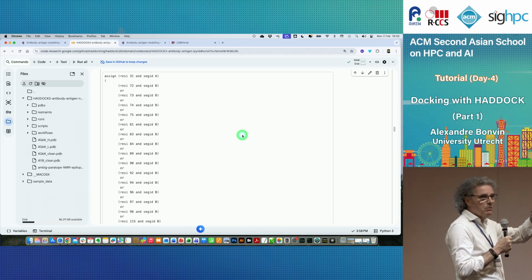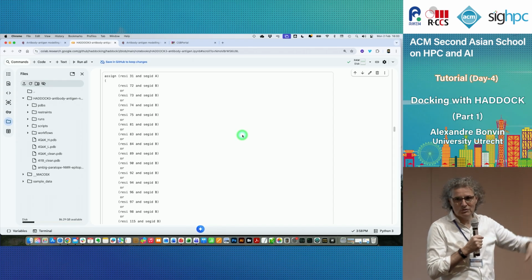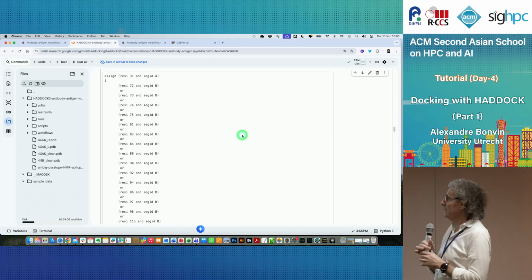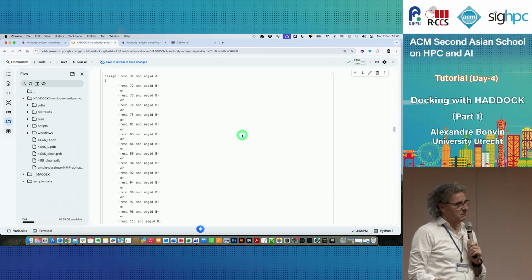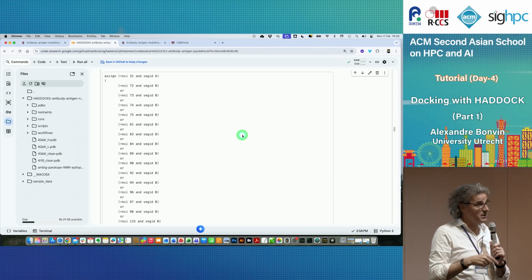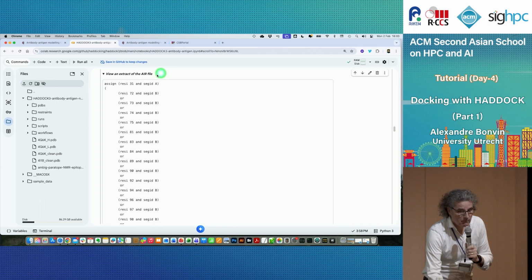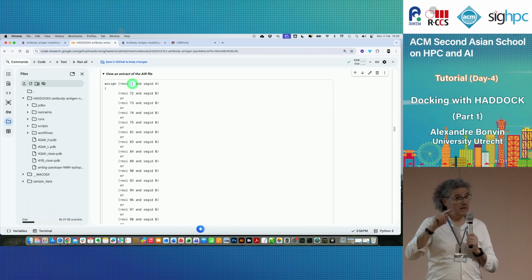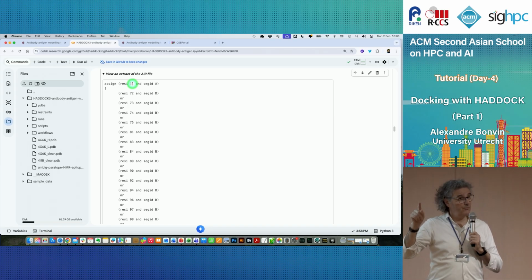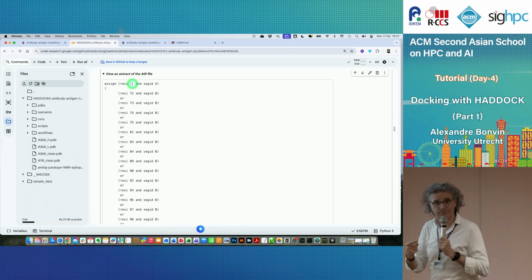We have 4 on the backbone, C alpha, C, O, and the nitrogen, and then the side chain. And some are very short, some are very long. So say on average 10 atoms per amino acid. So here in our long list of selection, for the second part, we have 40 amino acids. So this is 400 atoms that we select, that we have to combine with the first selection, which will be again 10, say. So the number of combinations is 10 times 400. So there are 4,000 individual distances that are used to calculate one effective distance.